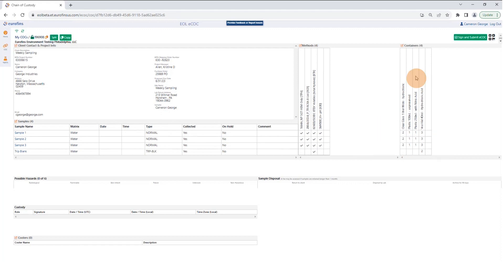You can edit any of these sections by clicking on the header, and you'll be taken to a screen where you can make changes to sample IDs, add a sample, make some changes to the methods, containers, etc.